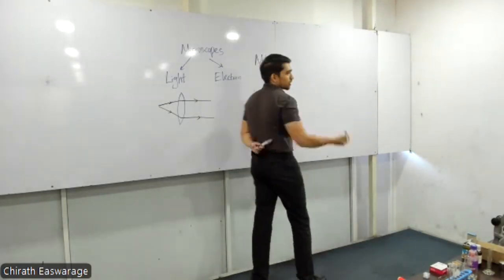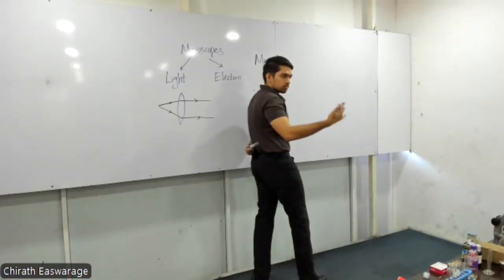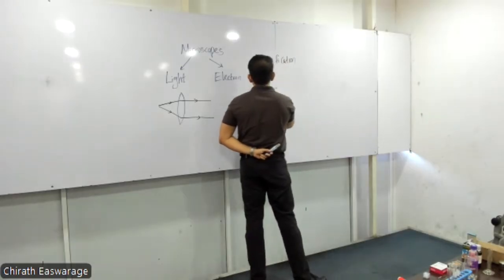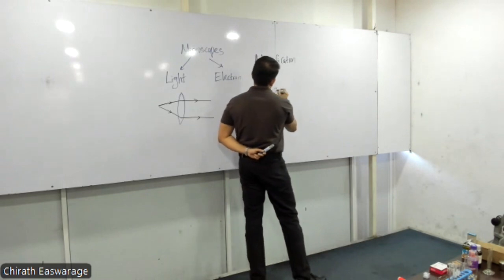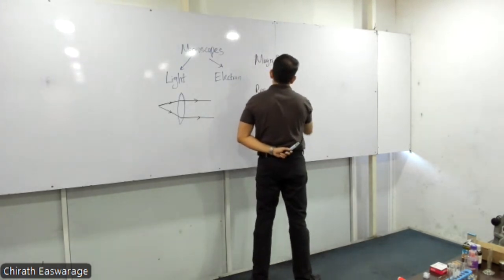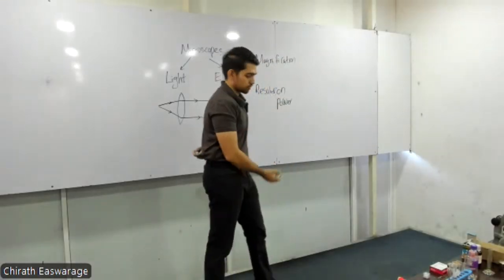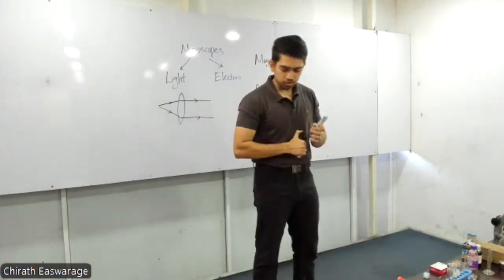That is magnification. For a vehicle we talk about horsepower, engine capacity, those things. Similar to that, for a microscope, we talk about its magnification and resolution power. Those are the 2 criteria. So the definitions of these you need to know. What are the definitions?